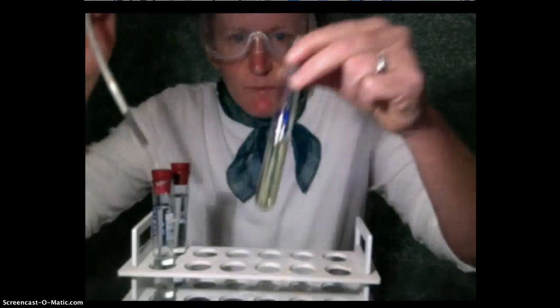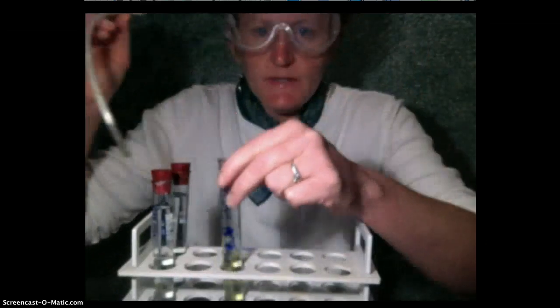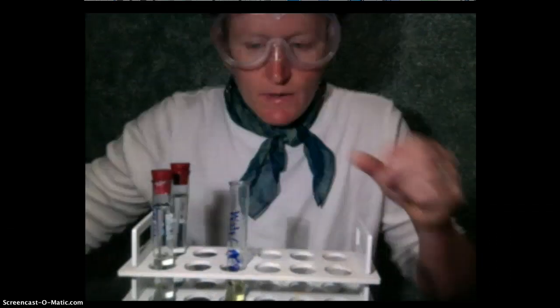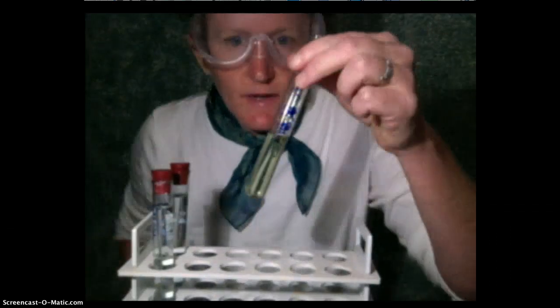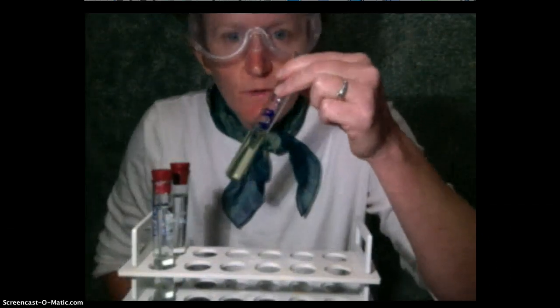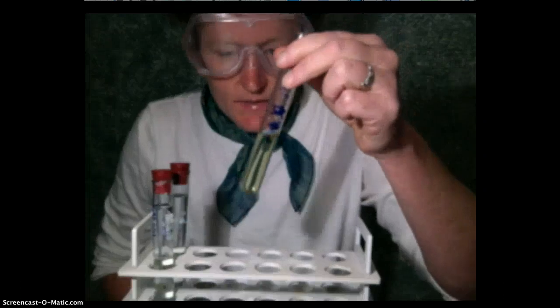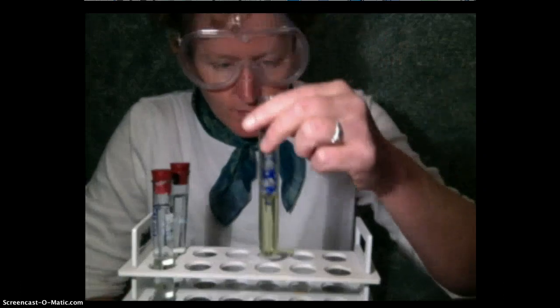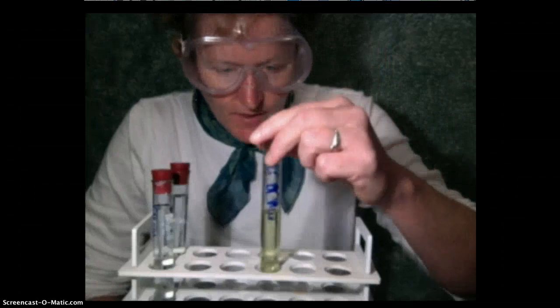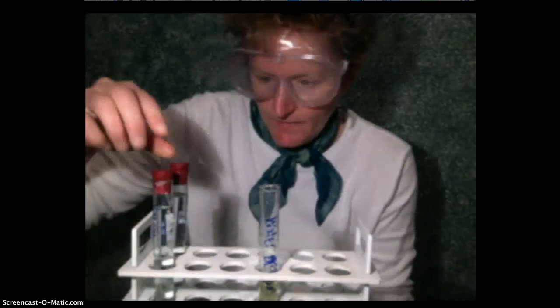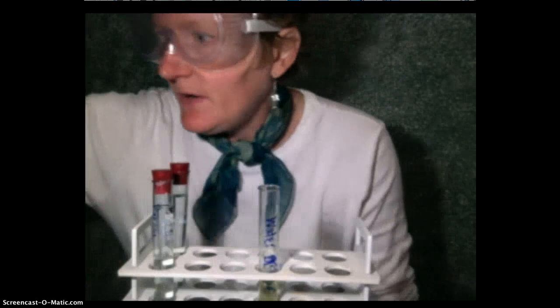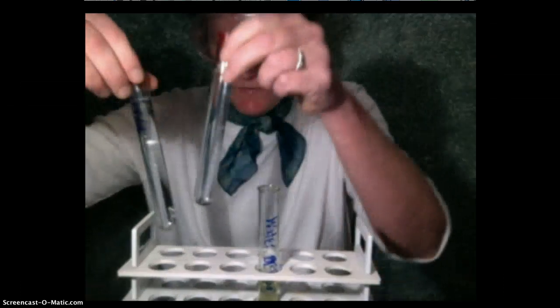What started out blue is now a nice yellow. So indicators can not only tell us a yes or no question, sometimes they can tell us how much by changing from blue to yellow, and they can do it slowly enough that we can kind of tell how much acid is there.